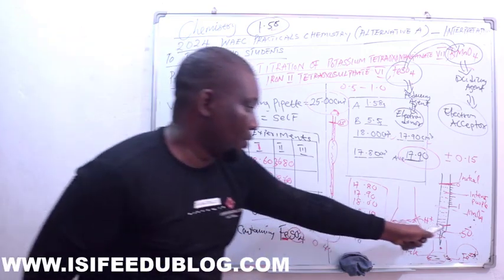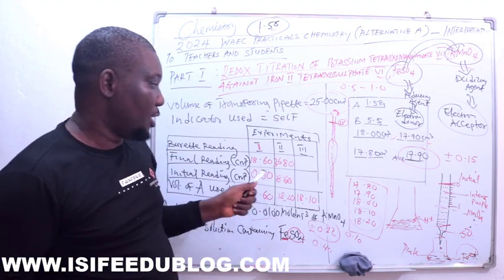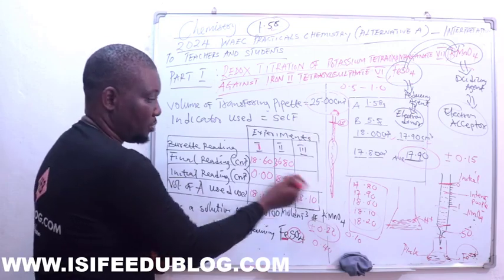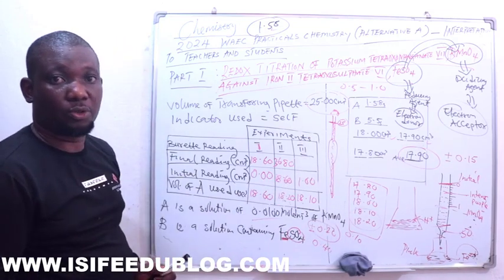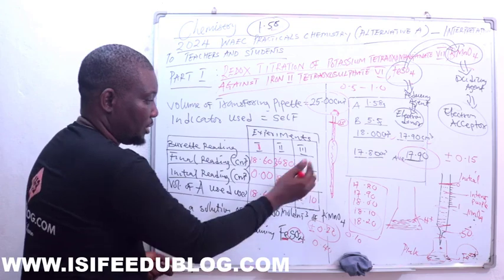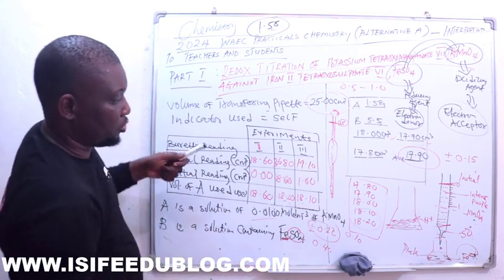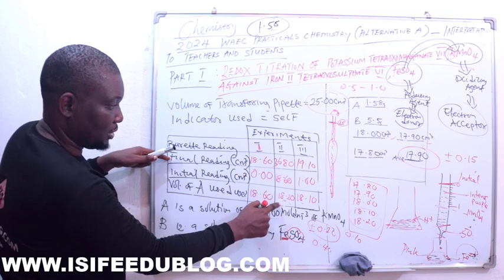So at this point where you are here, you have to pour a solution again. Like I said, don't try using this again. You can as well use anything, maybe not 0.00, maybe preferably 1.00, 2.00, 3.00 is okay. So what should be here? This should be 19.10, to make sure that this is different: final minus this is this.